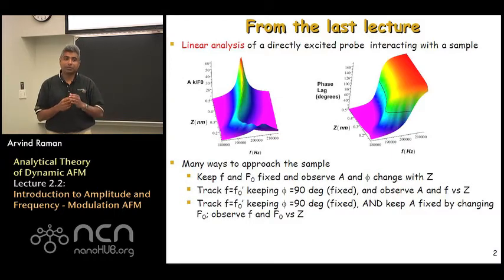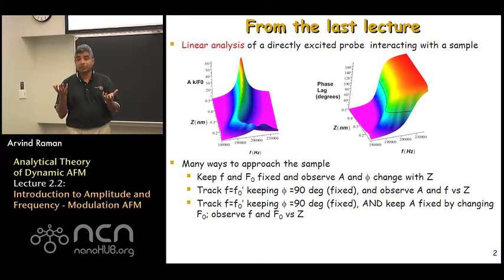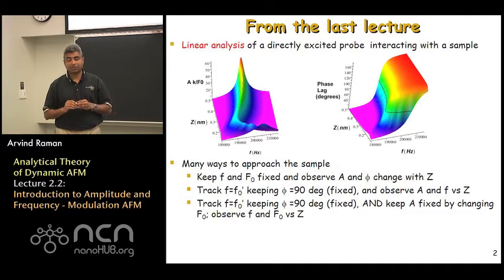What we really stressed last time was that when you do such an experiment, the amplitude decrease that occurs happens due to a combination of two effects. One effect is this resonance peak actually shifts from underneath the fixed drive frequency you're at. As a result, you're no longer at the peak, and so the amplitude tends to drop. But also, even if the resonance frequency didn't shift, the decreased Q factor would reduce the amplitude. So it's a combination of two effects that conspire to reduce the oscillation amplitude.